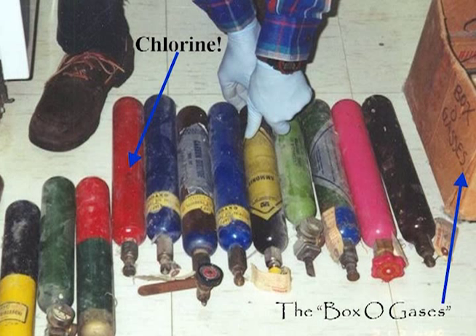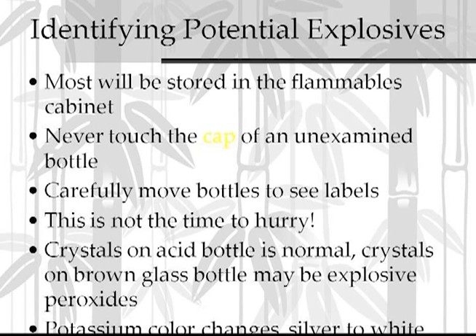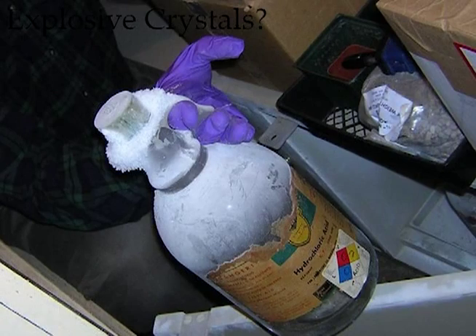These are all compounds that just pose a risk that we think should not be faced by students or by teachers. And frankly, most of these things, the person most at risk is not the kid in the class, because the teachers are watching out for their health. It's the teachers who are preparing diluted solutions from these highly concentrated compounds. And we don't blame teachers for buying these things. Most of these things were there before they were even born. A lot of these compounds date back to the 1950s and 60s when they were first purchased. And once people realized how hazardous they were, they just left them sitting on the shelf. So the new teachers have come and inherited these things, and quite often without an awareness of the risk that they're facing.